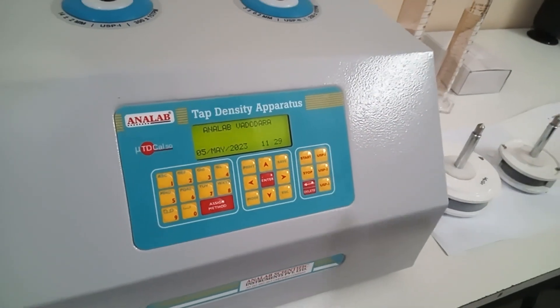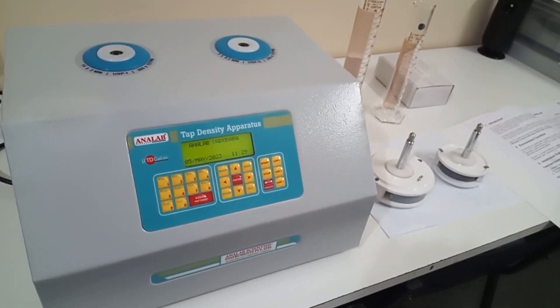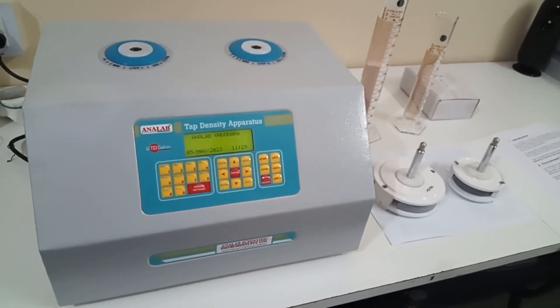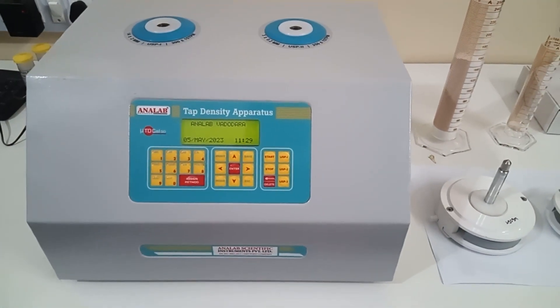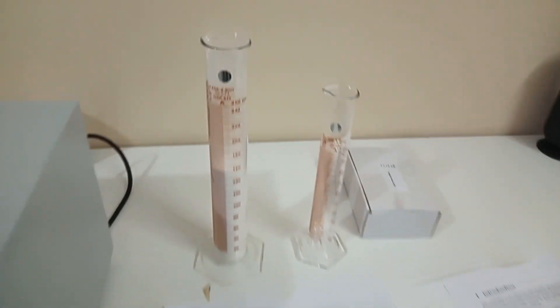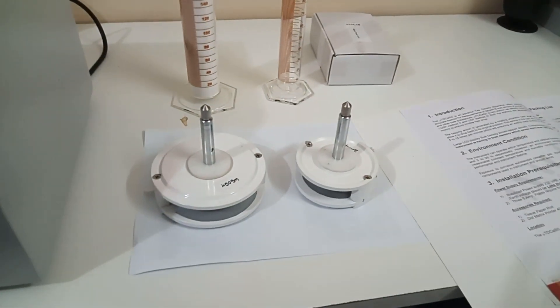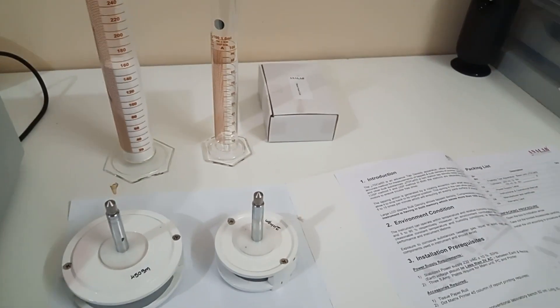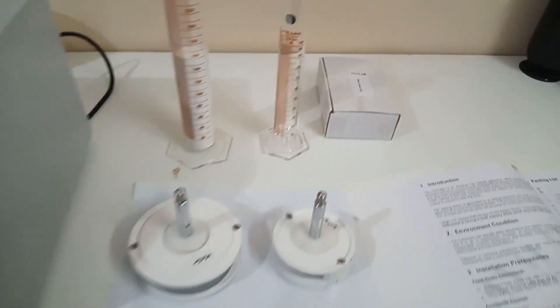Let me introduce the parts which are supplied with the instrument. First of all, the main instrument, supplied with 250 ml and 100 ml cylinders, then cylinder holders for 250 ml and 100 ml cylinders, instruction manual, and power supply cord. These are the main parts which will be supplied with the instrument.